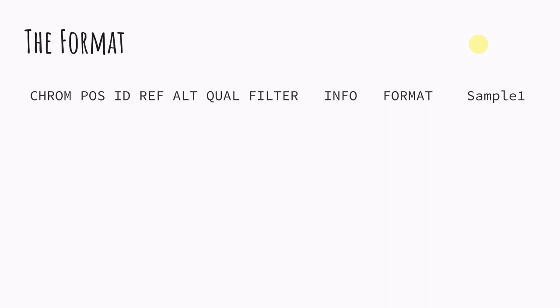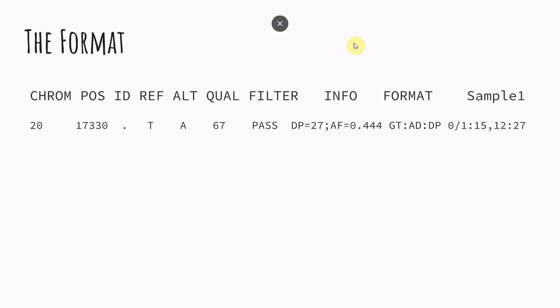And then for the format, let me show you here. It might be easier if you can see. So here we have our chromosome. This is the position where the variant occurs. For ID, this is just an example. If some variants have an ID, they've been seen before and they've been given an ID number. If it hasn't been seen before a lot of times you'll get this dot, which just means it does not have an ID.